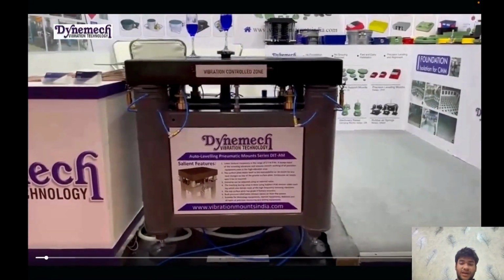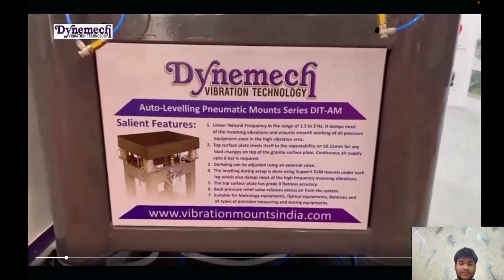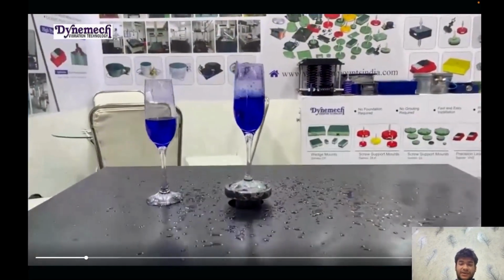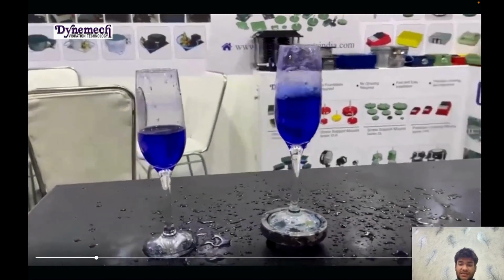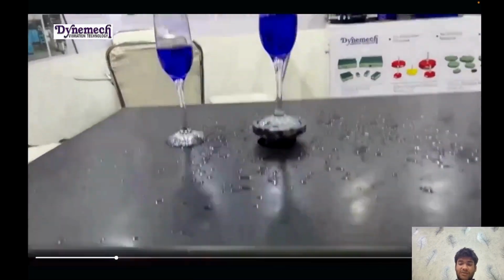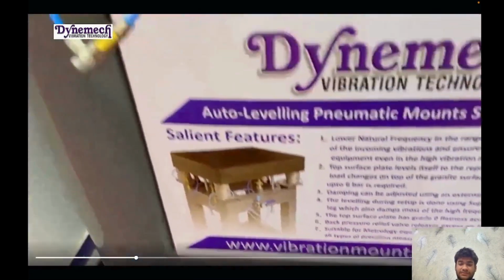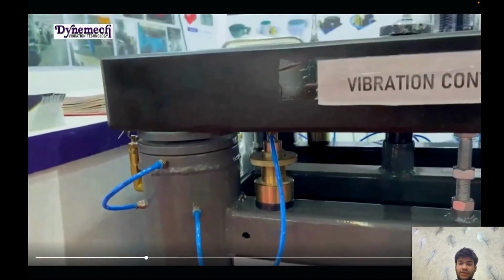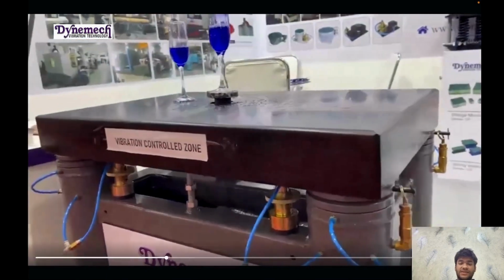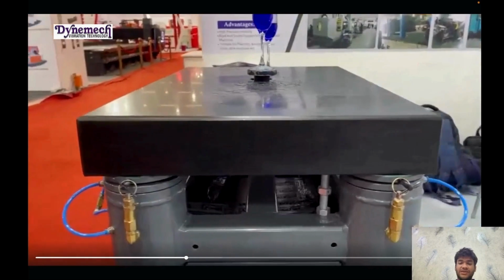Here we have a demo of an anti-vibration table. We can see there are two glasses, one which is connected to the bottom of the table through a through hole and encounters vibration at the bottom of the table, the vibration zone. We can also see the other glass which is located on the free floating isolated granite slab which is vibration free.